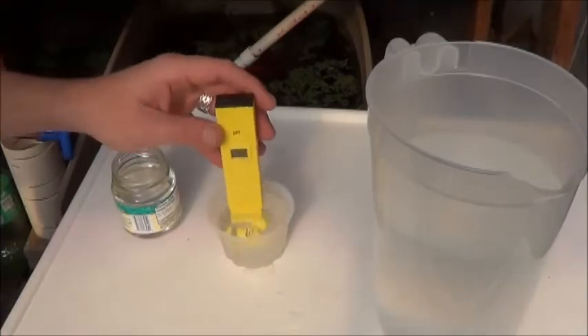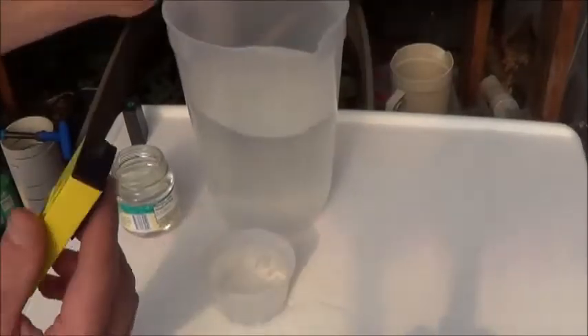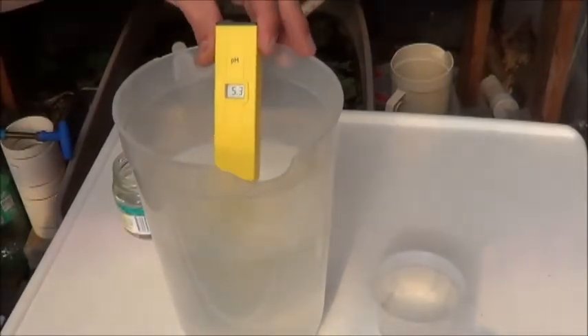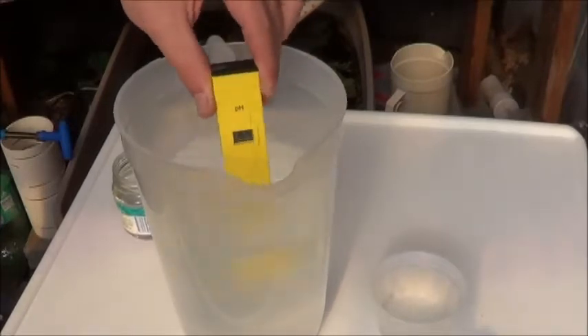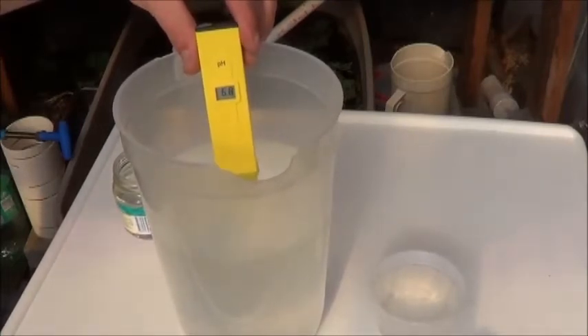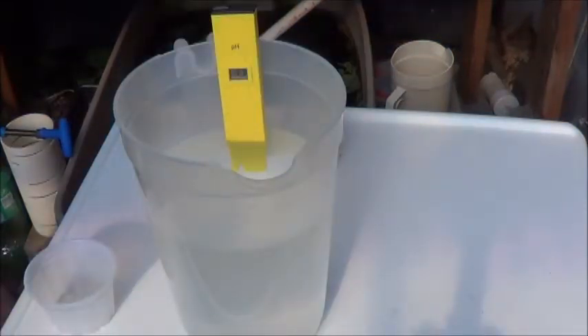Just going to rinse it off here in the tap water, make a mess of my table, fill that up again. But while I've got my tap water here, let's just take a look and see what that reads at. Stir it around a little bit so I can read a little faster — thanks for that bit of advice, it seems so logical when you say it out loud. It's up to a 7, so really I guess that's not so bad. It seems to have stabilized itself at 7.3 for the tap water. So at least now we know what that's starting at.